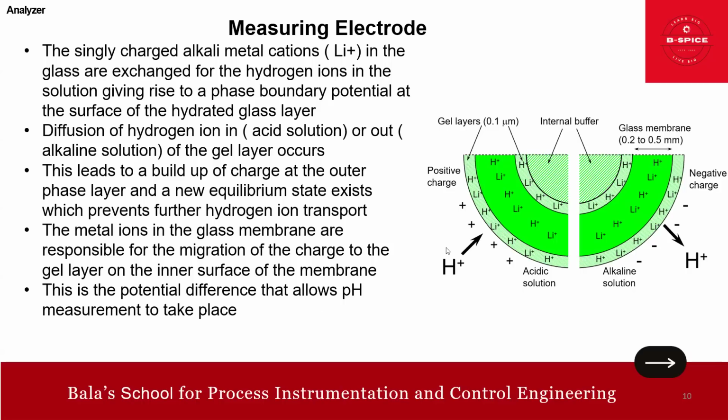So this is the potential difference that allows the pH measurement to take place. That is the principle, friends. I hope it is clear. Anything you want to clarify, you can write to me.